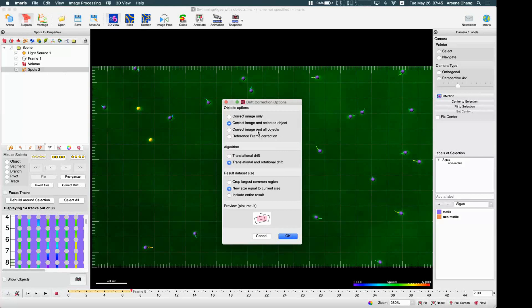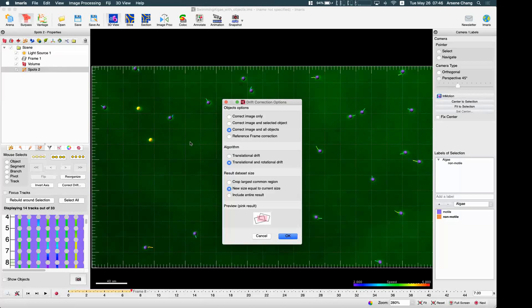The second option is 'Correct Image and the Selected Object,' which means this spot tracking result will be corrected as well for all the spots inside this spot object. The third option is — let's say on the same image I have spots and some other cells which I also tracked — by selecting 'All Objects,' all the track results will be corrected based on this drift correction.